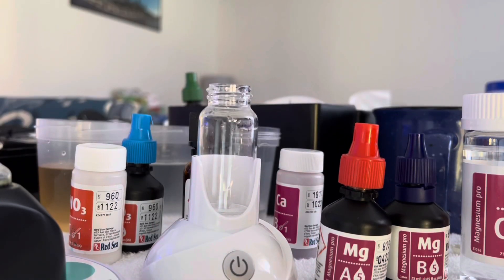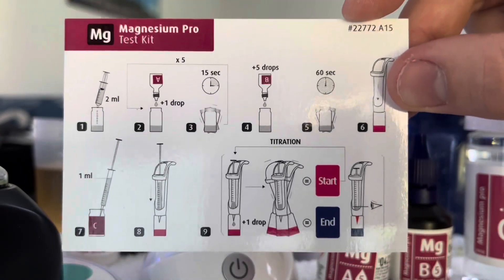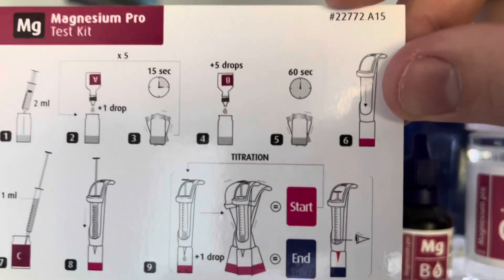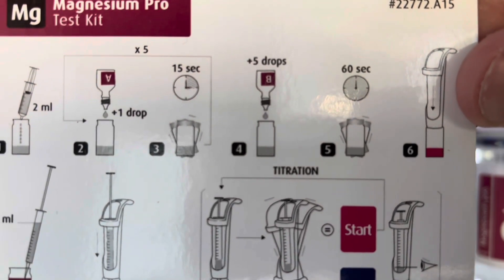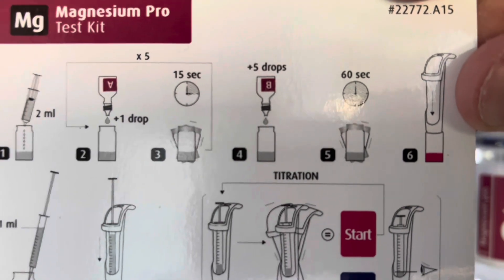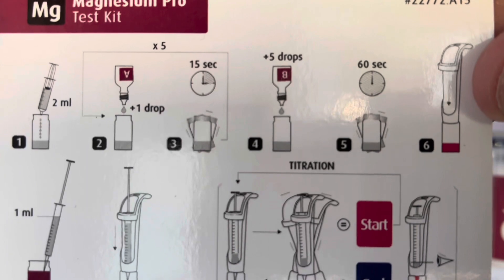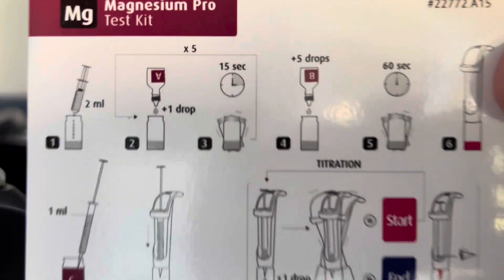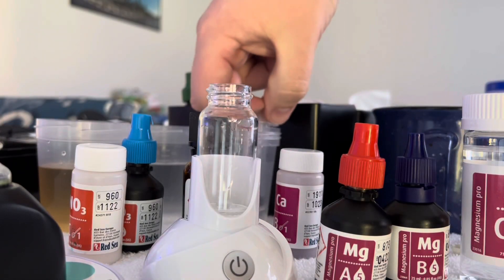Good morning. Today we're going to do the magnesium pro test kit from Red Sea — it's another titration test kit. This one is more difficult in that reagent A is one drop, you wait 15 seconds, then another drop, wait 15 seconds. You do that five times. We start with two milliliters of water, so let's get our water pulled up here.